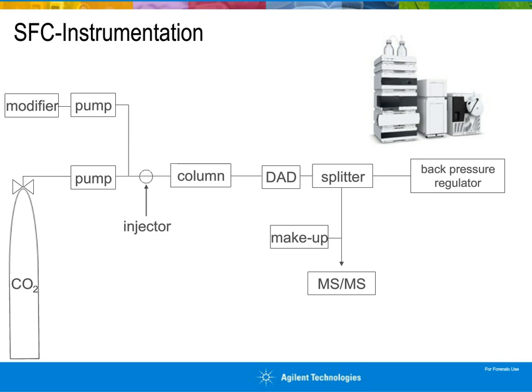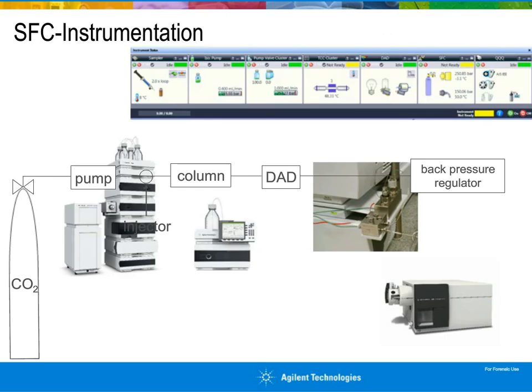If we look more at the instrument itself, you can see the pump for the CO2 and the injector and column compartment, all integrated in that one system.